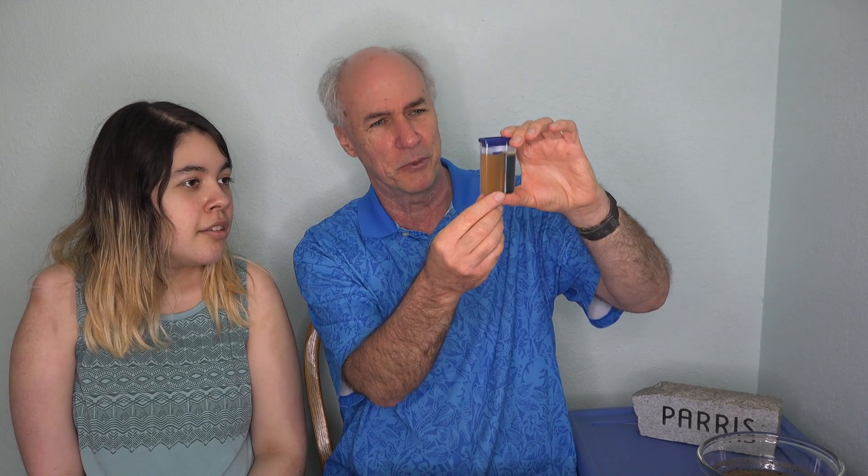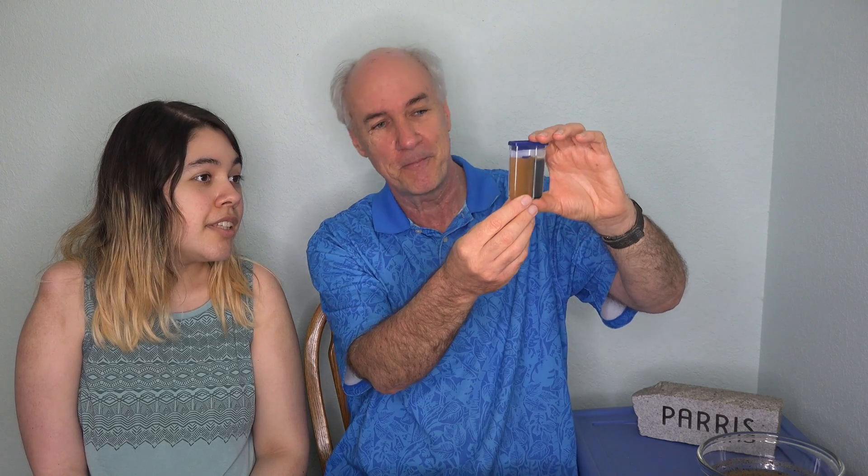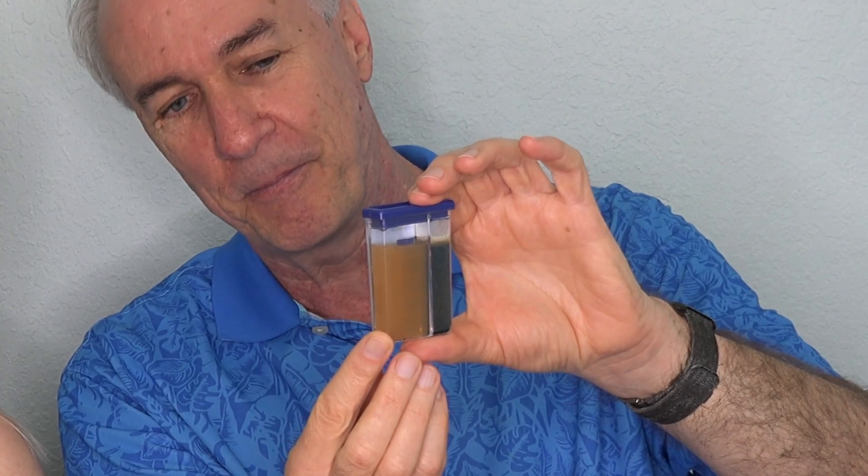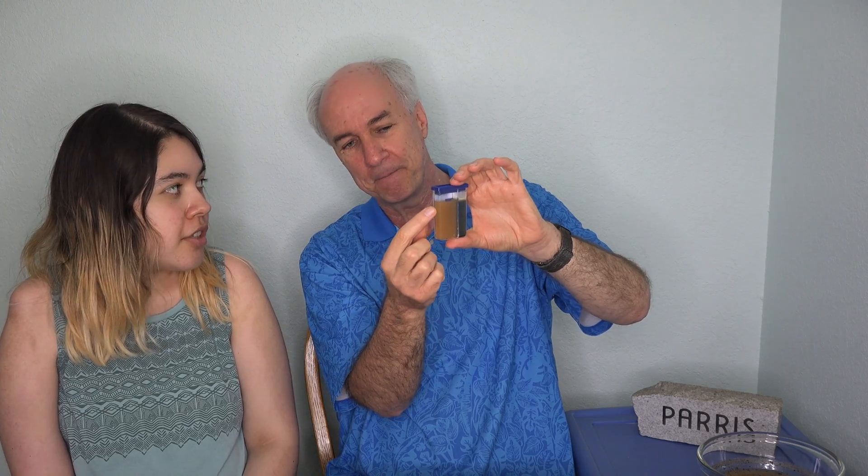Let's look at phosphorus. This is a bluish one — we got some color. My daughter guesses P3, sufficient, and I agree with her. That's definitely the closest match. So we have a sufficient amount of phosphorus — something I don't have to go buy and put in the soil.